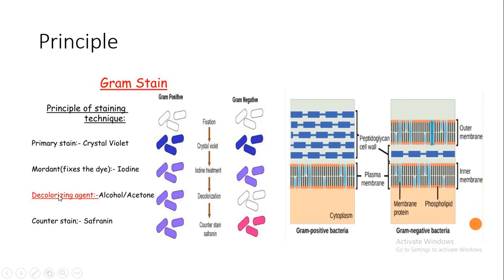So here, both the gram-positive and the gram-negative will be stained blue at this stage. Now we do a decolorization treatment with either alcohol or acetone. On decolorization, the gram-positive bacteria, which have less lipids, do not form pores in the membrane, and they have a very thick peptidoglycan layer as well that allows the gram-positive cells to retain the complex of crystal violet and iodine. While in the gram-negative bacteria on decolorization, the lipids in the membrane dissolve, creating large pores in the membrane. As a result, the crystal violet iodine complex is lost.